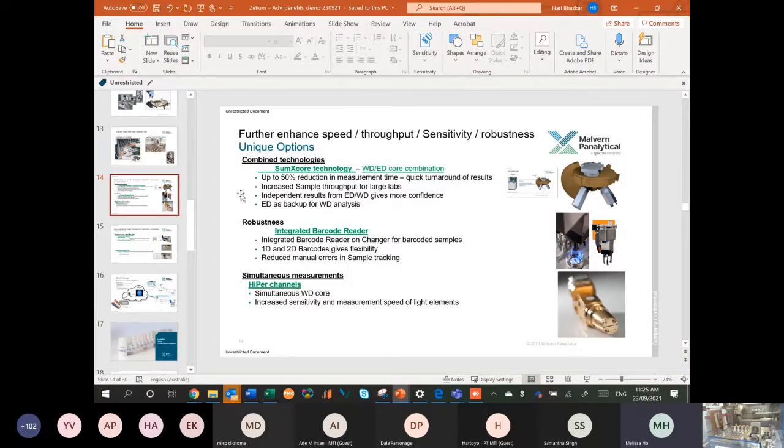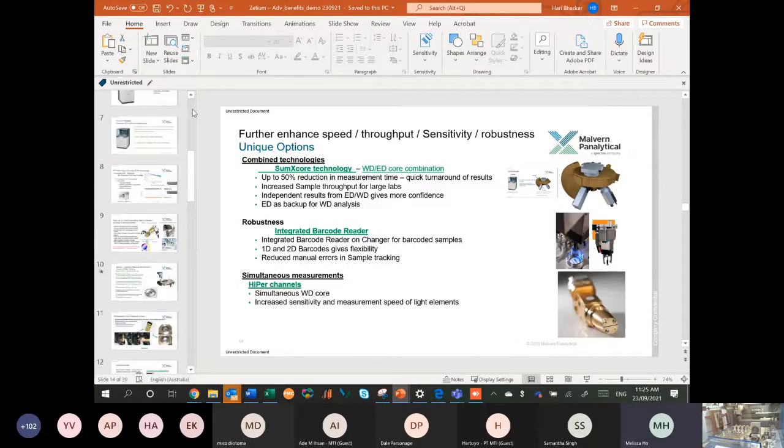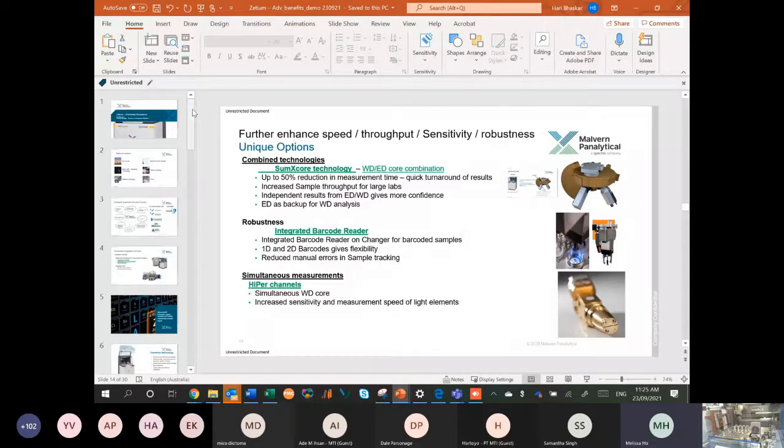Thanks for that. Just a question about the press pellet method. So do you recommend, if we're using the press powder method, going without the cellulose binder?